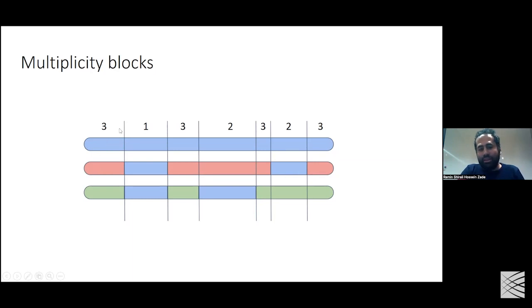So, for example, at the start of this chromosome, these three haplotypes are different, but then they're identical at some location. And if this region is huge, it's impossible to link what you have here to what you have over there. So what HAT does is that first, based on the seeds that it creates, it tries to find these ploidy blocks, to find at which regions it can reconstruct three haplotypes and at which regions it can reconstruct two haplotypes.